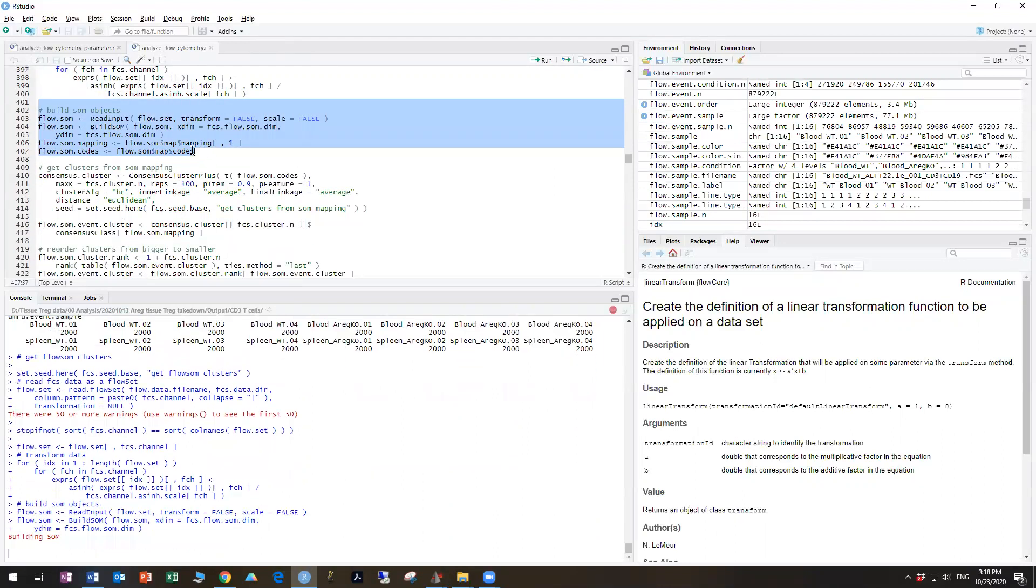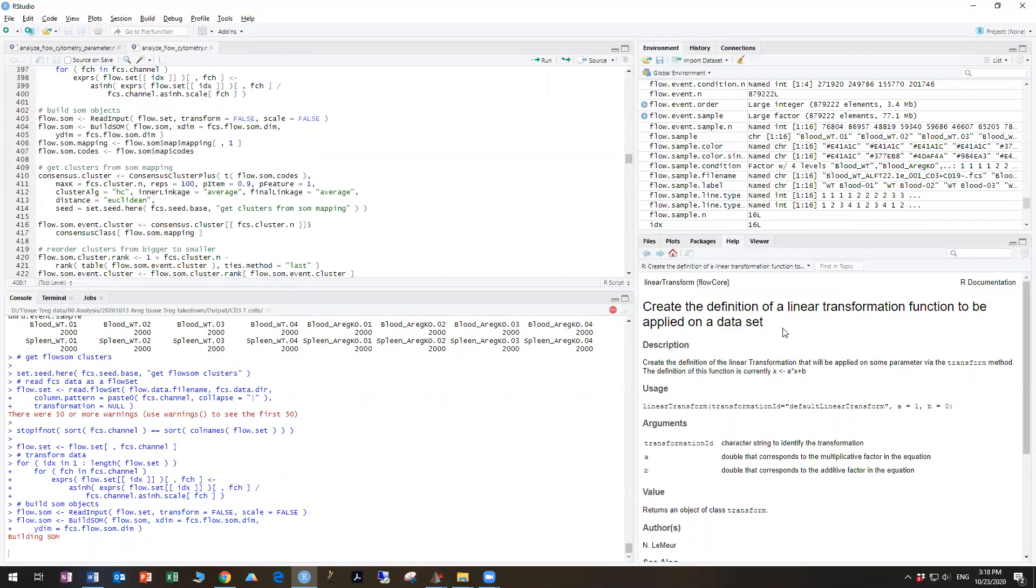So FlowSOM stands for self-organizing map, and you can read the paper by Sophie Van Gassen to learn more about this procedure. FlowSOM is relatively quick compared to t-SNE, so it shouldn't take too long.